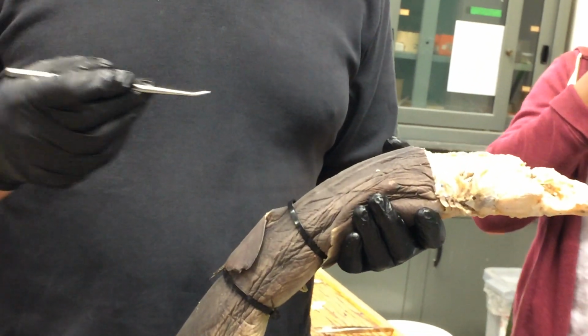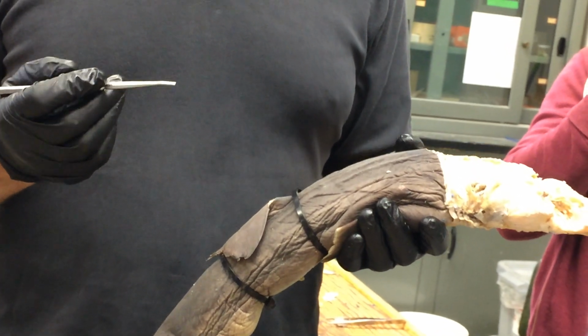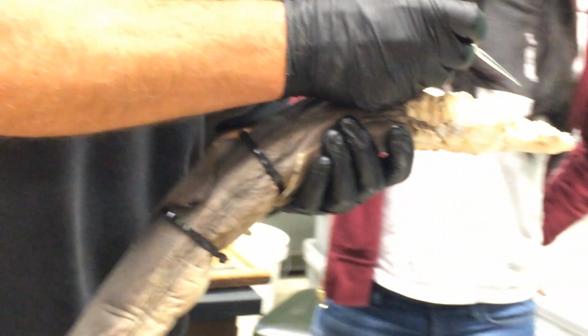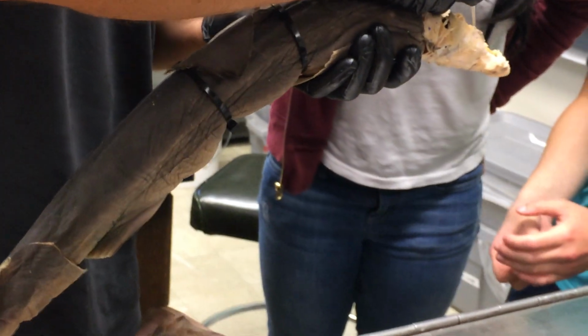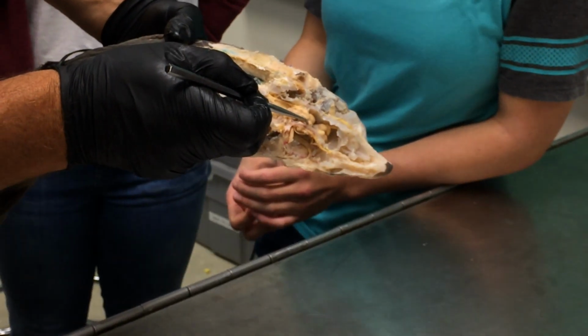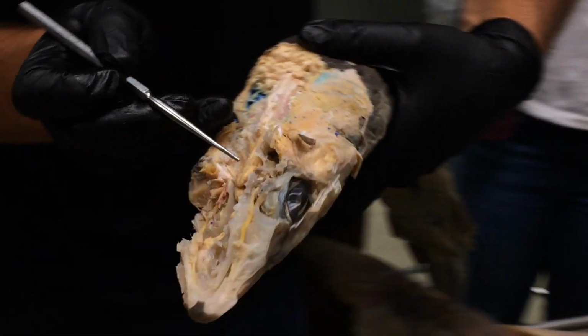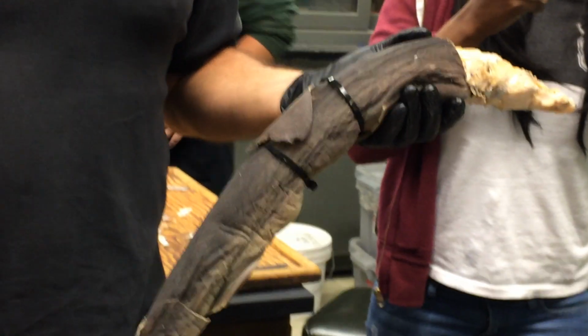Moving back, what comes next after diencephalon? Mesencephalon, or midbrain. And in the shark, what we see of the mesencephalon are these 2 big lobes here, here, and here. What are those called? Those are the optic lobes, exactly. So these guys here. And the optic lobes are getting information from the eyes.